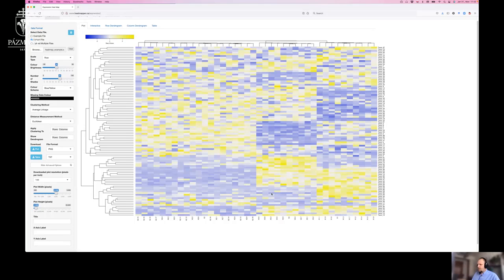For example, we can obtain a cluster here, which means that in this group of samples, we can see that these taxa are expressed or have a high contribution compared to others. In this bluish area, we can see that these taxa, like taxa 2, 8, and 5, are just missing from this group.